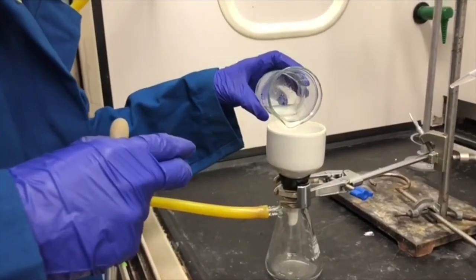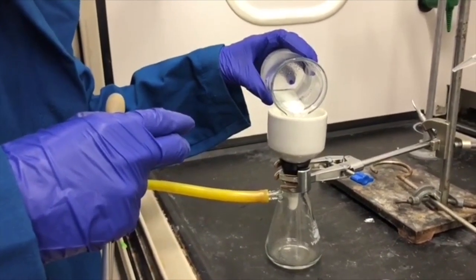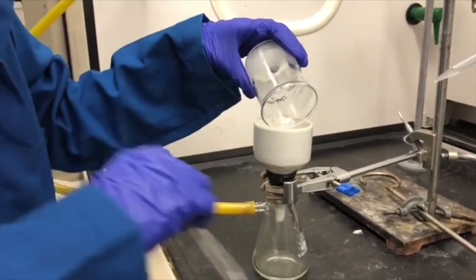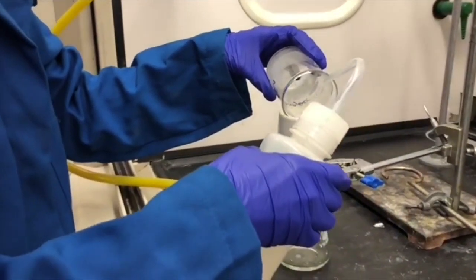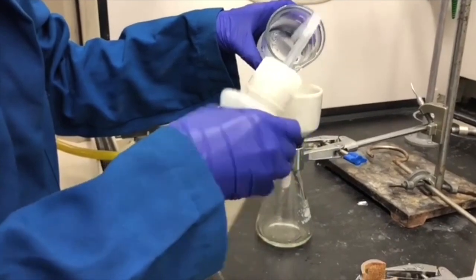We're doing our second suction filtration in order to filter out our crystals, that is our pure product. I'm washing it with 95% ethanol to get everything out of that beaker.